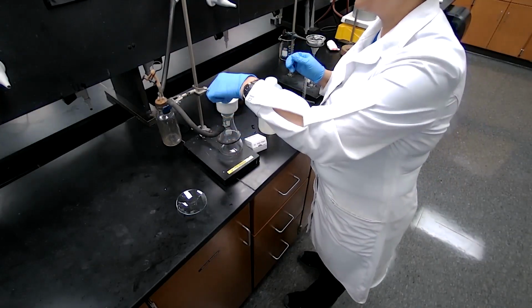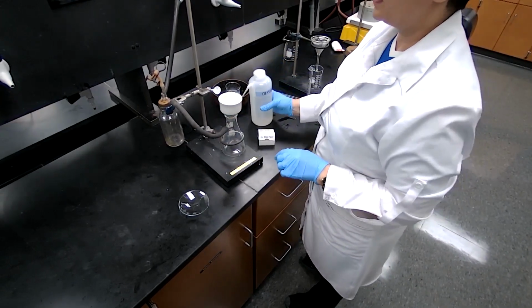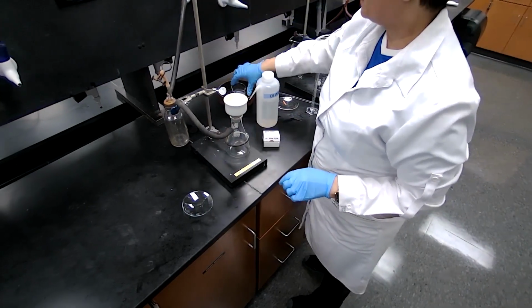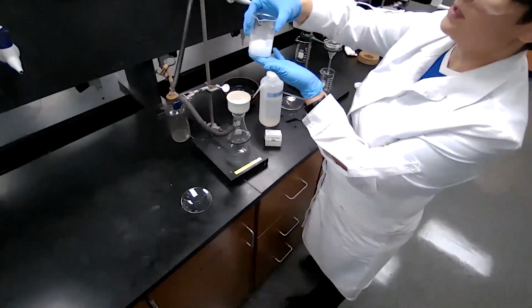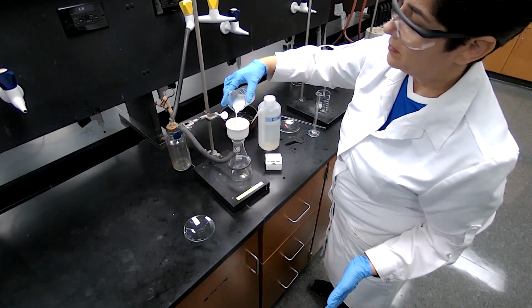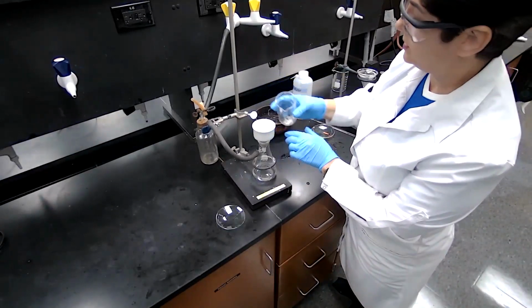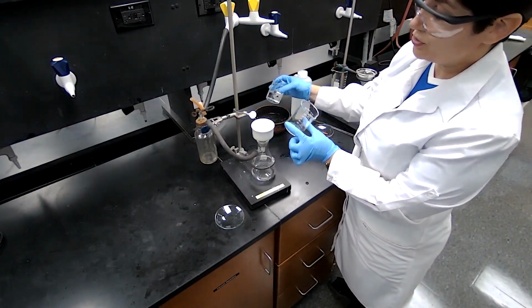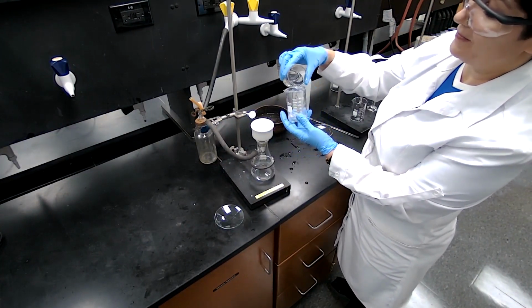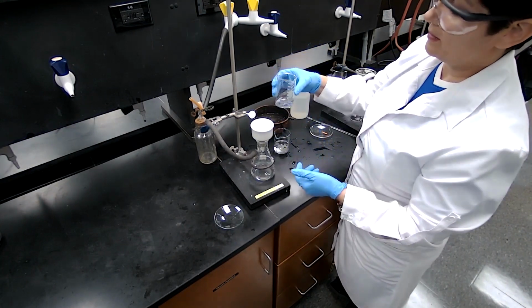Place the pre-weighed filter paper in the Buchner funnel. Add a few drops of water so the filter paper doesn't move around. Turn on the vacuum and pour the mixture over the filter paper. Vacuum is on. We put all the mixture into the Buchner funnel, and to make sure there are no leftover crystals, we use some cold water, the water that was previously placed in the ice bath, and transfer that.